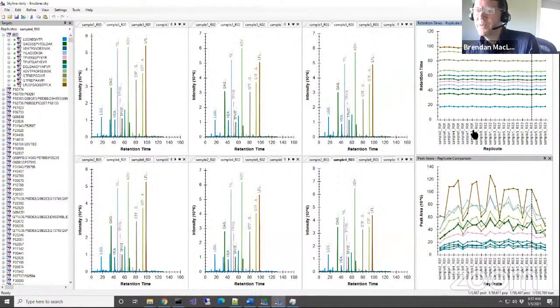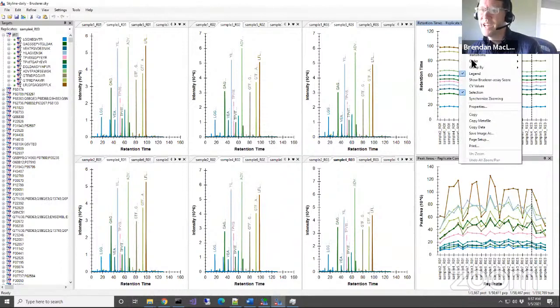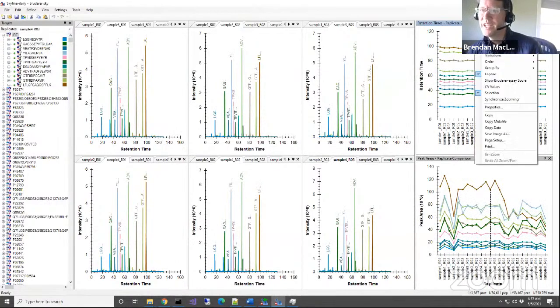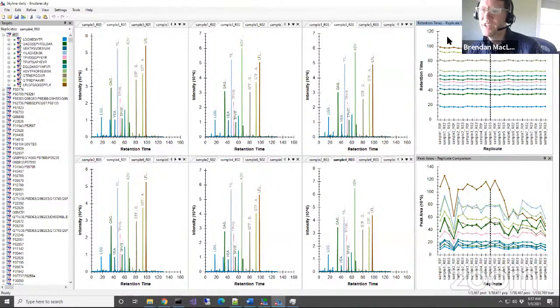Okay, so we have nice randomization. These are obviously differently ordered, and actually, I was probably wrong about the whole column conditioning thing, because that wasn't actually the acquisition order. Back here, I said this might have been the first run, but it wasn't actually the first run in time. It was just the first run in the way I had things ordered.